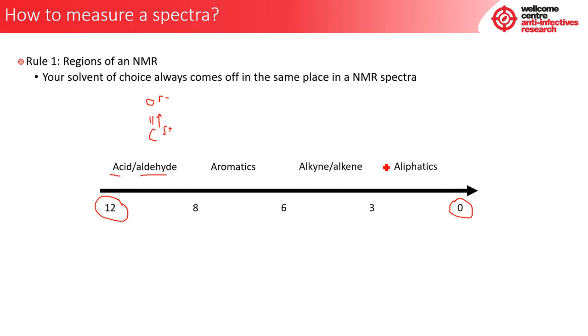You have your aliphatics, which are typically your CH3s, your methyls. It can be long chains, for instance, like heptane, hexane. You then move into your region of 3 to 6, and you find that you start to incorporate some of this electronegativity through double bonds, for instance.